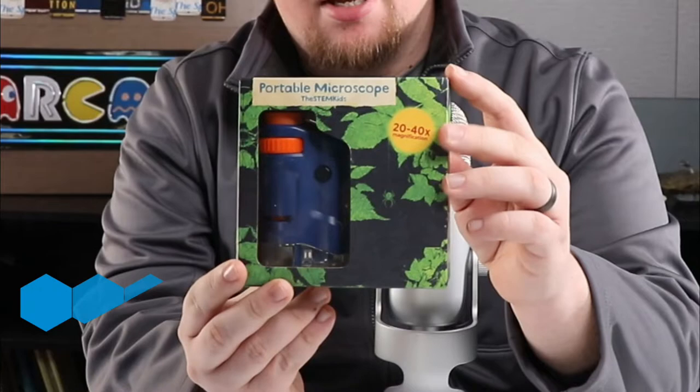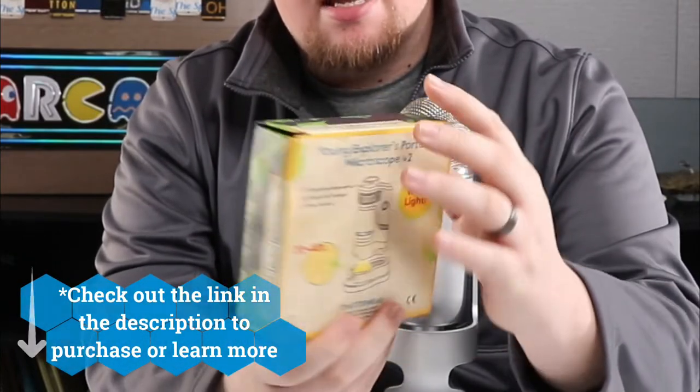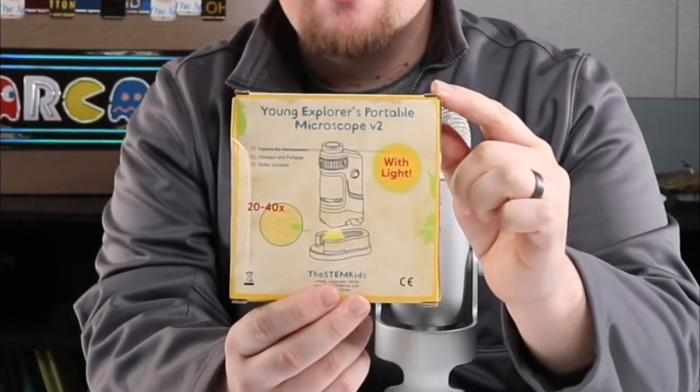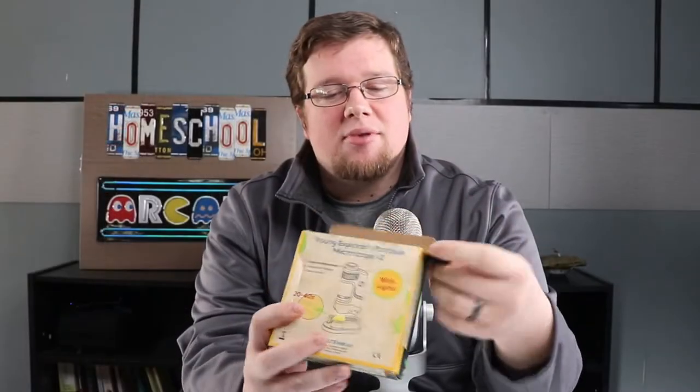Here it is — the STEM Scope. What we're going to be doing is unboxing this for you. I'm going to show you some of the components, how to get it started, and we'll actually have our kids take a look at it too so you can see their reactions. We're going to pop this open right now.